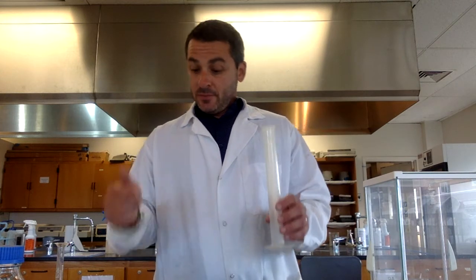Now, to find the volume, I'm going to find the volume of this metal by displacement, which means I'm going to put a volume of water in here, record that volume, then add the metal to this graduated cylinder and record the new volume. The volume will increase by the amount of the volume of this metal.